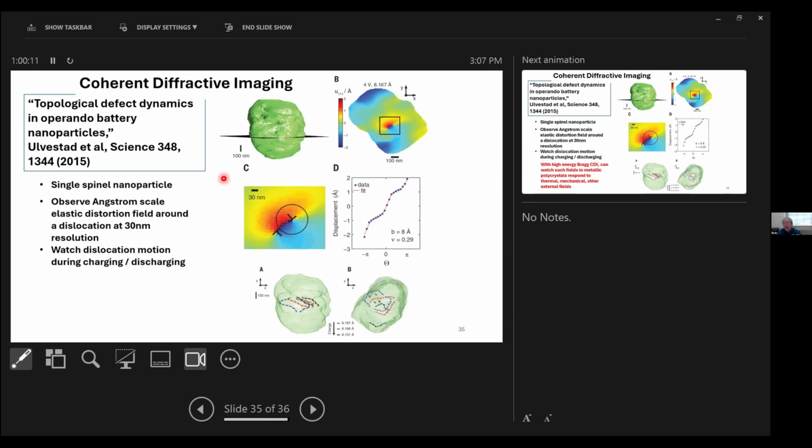Yeah, so one solution to the problem of the pixel size is that one can put an optic in the diffracted beam. And that's essentially what the dark field X-ray microscopy does that Henning Poulsen and company are working on at the ESRF.